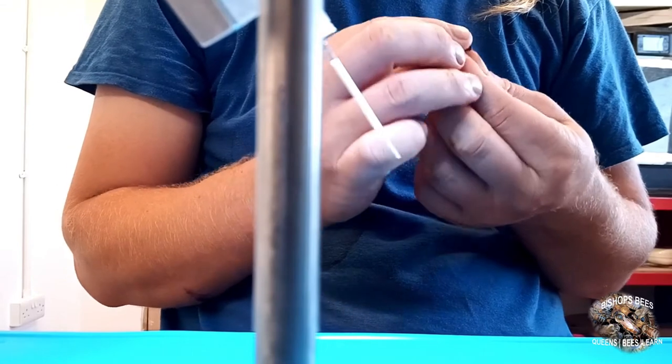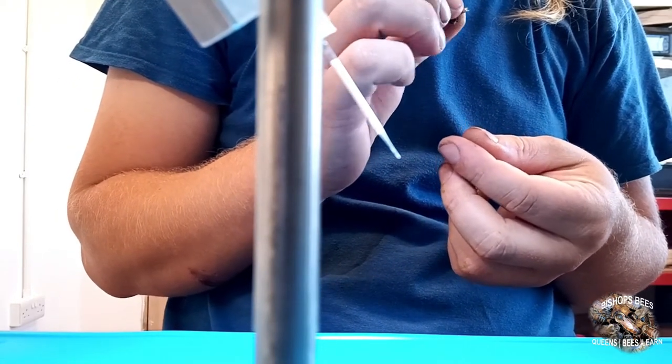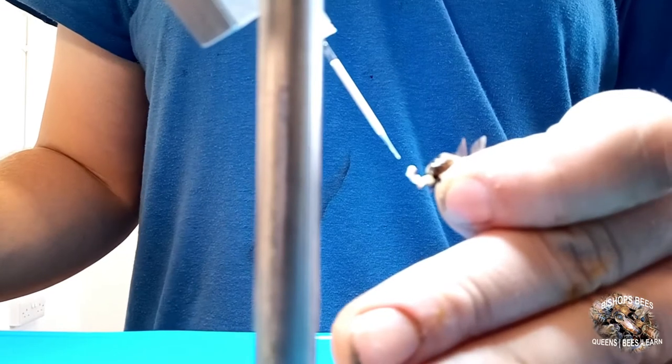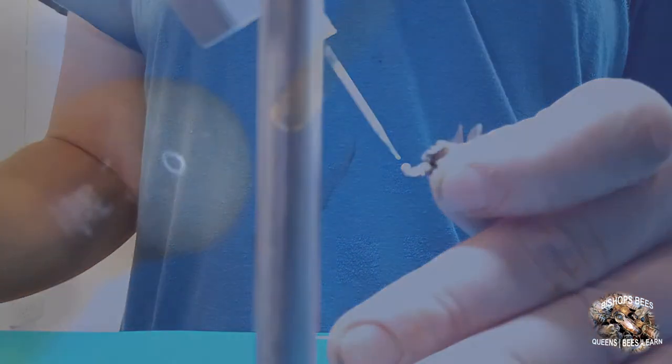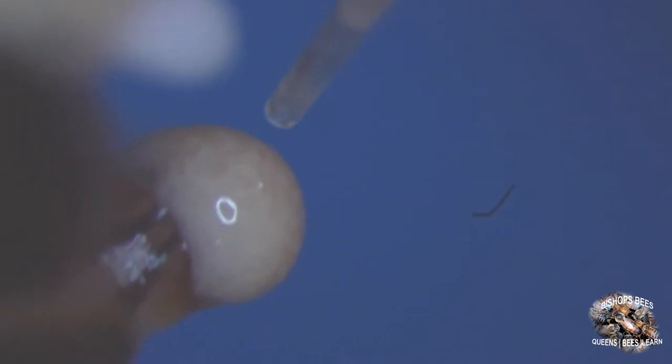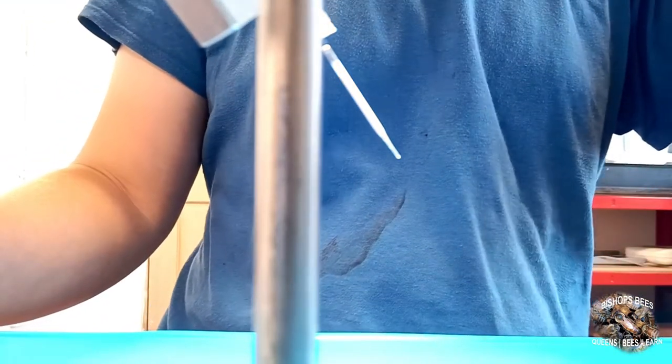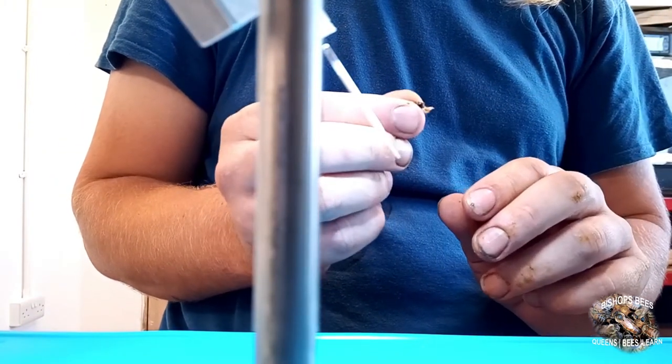To collect the semen from drones we first have to evert the drone and expose the endophallus. We do this by applying pressure either side of the thorax for partial aversion, and rolling pressure down the abdomen for full aversion. The bulb of the endophallus will hold a mucus plug with a small amount of semen. The semen has a marbly texture and creamy coloration. To collect the semen from the drone we eject a small amount of saline or semen onto the bulb, then draw this back up into the insemination tip, drawing the semen off of the mucus plug. It is important that we don't draw any mucus as this will clog the tip and prevent further collection or expulsion.